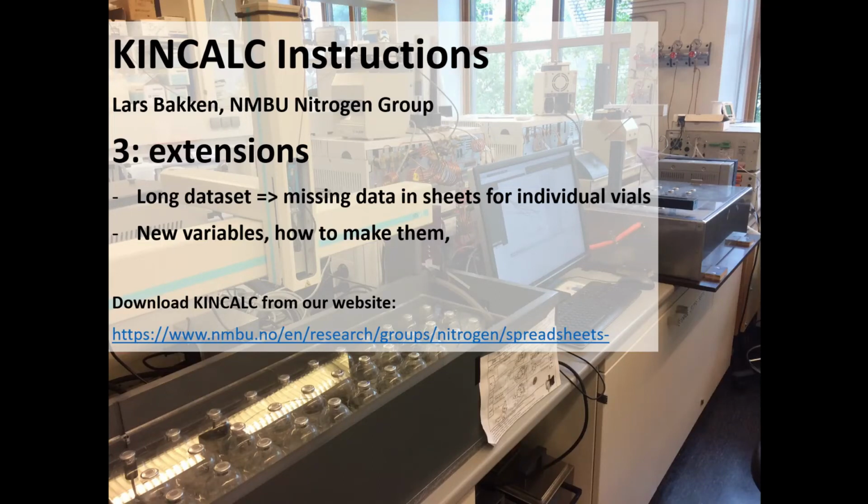This video is called Extensions, and it is a brief introduction to how you secure that long data sets are treated adequately by adding missing lines in the sheets for individual vials and new variables, how to make them and how to make them in all your sheets.